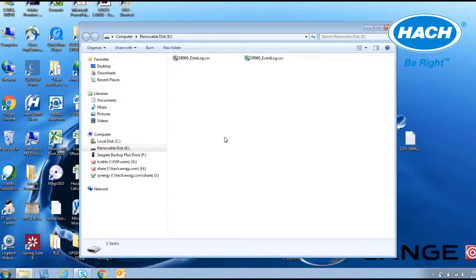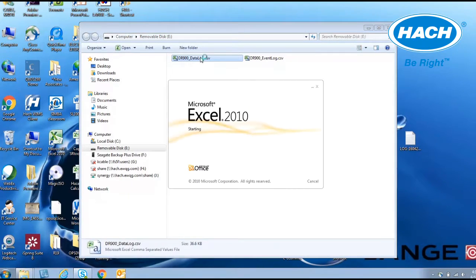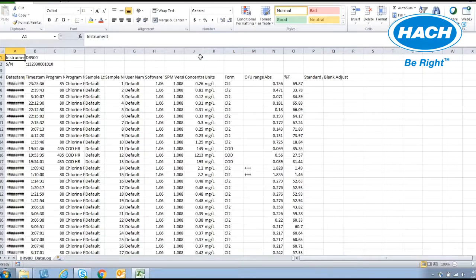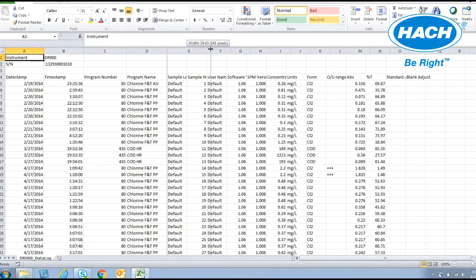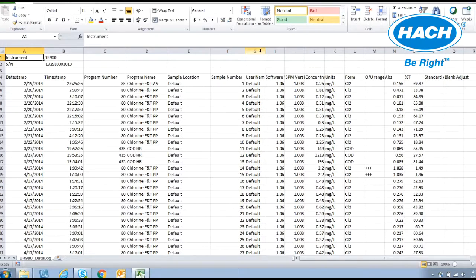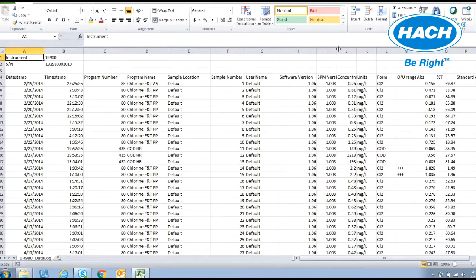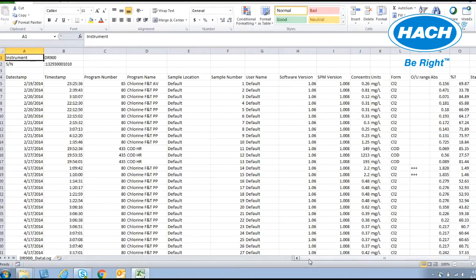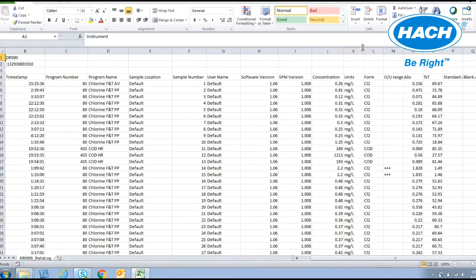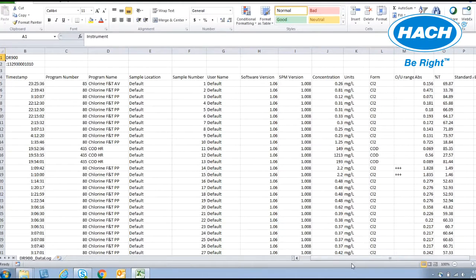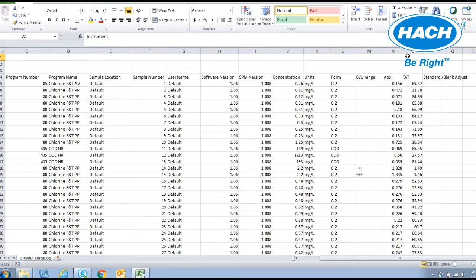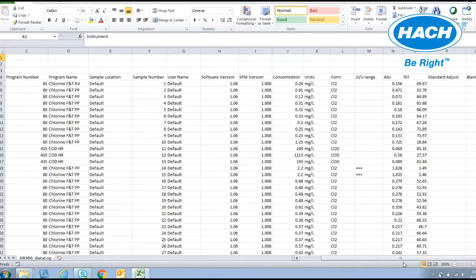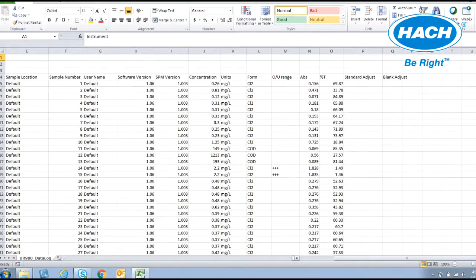When the drive is open, two files are visible: the data log .CSV file and the event log .CSV file. The CSV file contains important information such as instrument serial number, date and time stamp, program name and number, sample location and ID number, user name and operator ID, and software version. The measurement information also includes the measurement concentration, units, chemical form, if the measurement was over or under range, absorbance and transmittance values, and if there was any adjustment to the measurement such as a standard adjust or blank adjustment.